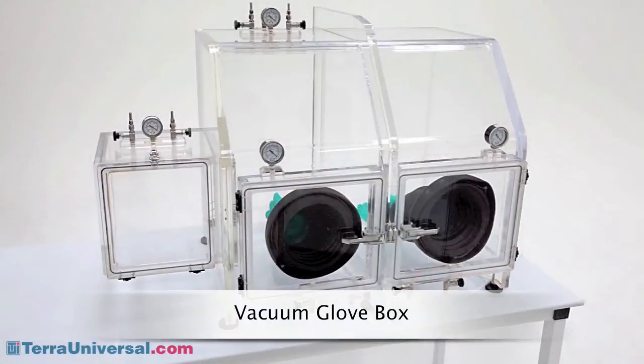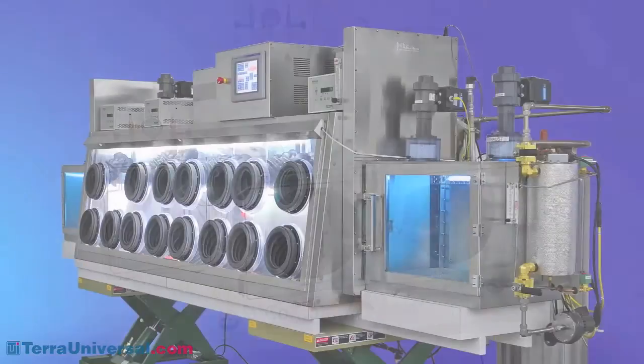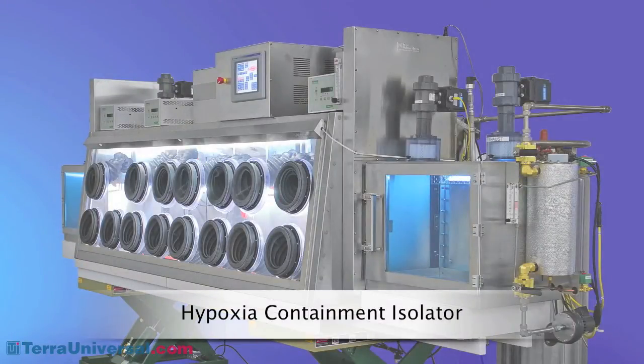A variety of technologies, including vacuum cycling and regenerating catalytic systems, achieve single-digit PPM oxygen concentration levels. Tera provides oxygen analyzing systems that monitor and display concentration levels and automate gas control. Selection of the proper unit with a stainless steel chamber and oxygen analyzer allows anaerobic drug efficacy and dosing studies, as well as oxygen-free lithium battery processing, titanium welding, and a host of other processes.